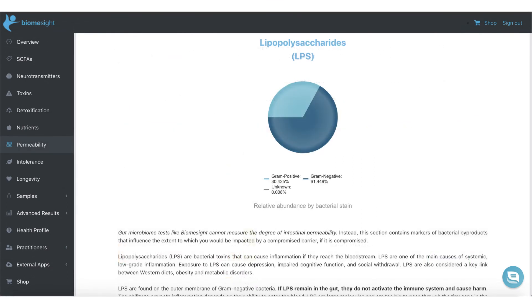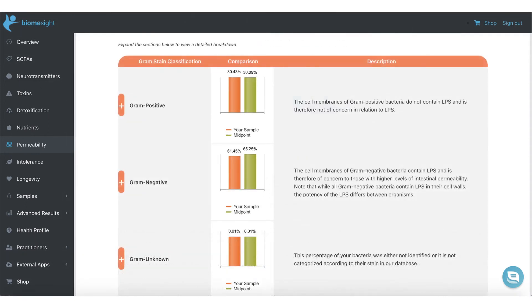The permeability section gives you the ratio of bacteria that contain LPS in their cell walls. LPS is a bacterial toxin which is released when the bacteria die. Whether or not this will affect you and reach your bloodstream is dependent on the permeability of your gut lining.